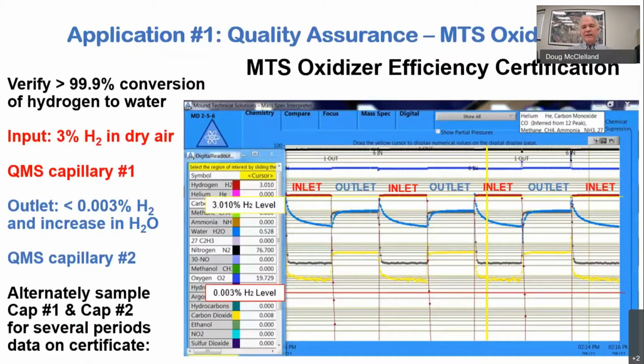Below the red line, you'll see a lighter blue line. That trace is the water vapor, and you'll notice that it's very curved. It starts out high, and it's at its lowest point just as we leave the inlet. That's because water vapor is very tenacious. It's going to stay on all the surfaces. This is where I was talking about how the mass spec takes its measurements very quickly. The issue is getting the sample. The new sample coming in must completely replace the previous sample in order to get an accurate measurement of that.